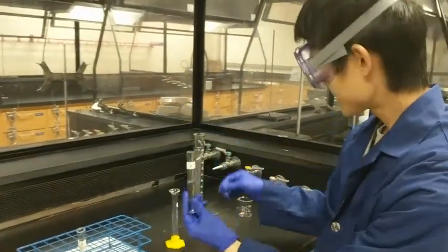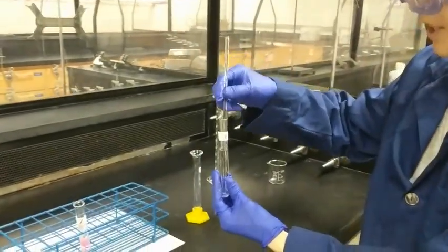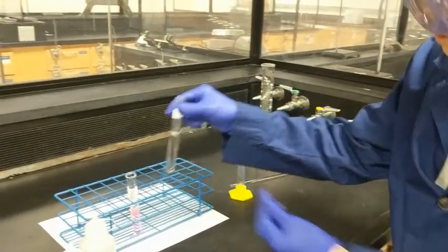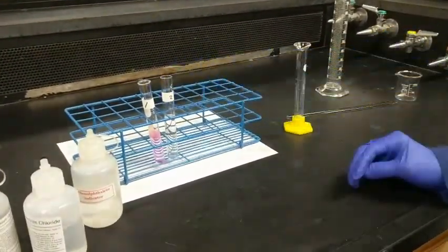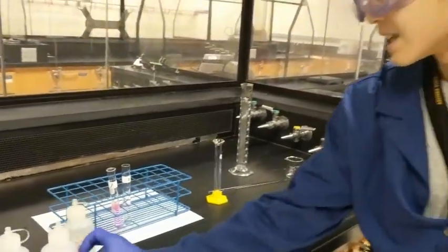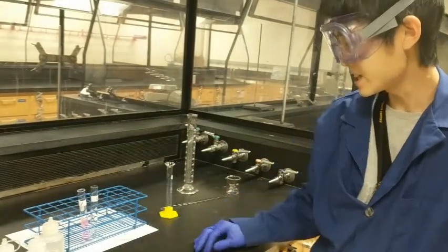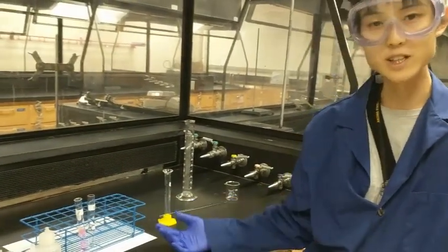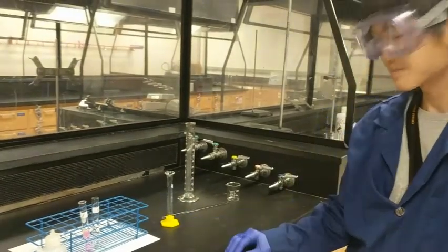And now I'm going to gently mix it together. Now you can see after adding the ammonium chloride solution, it became colorless, right? So based on this color, please predict in which direction the chemical equilibrium shifted.